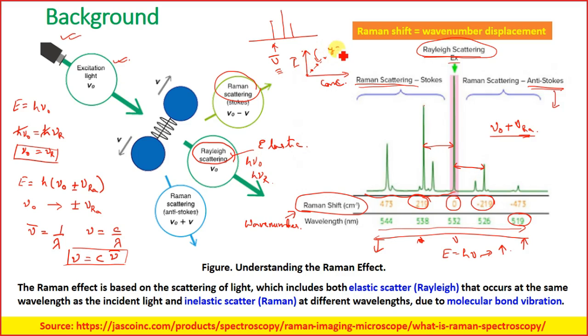From here you will get y equals mx, which we talked about last time. Now you have the m, and from the test run you get the intensity y. So you find out x, which is the concentration, right? All the quantitative analysis we do using Raman spectroscopy is to be done in this fashion.